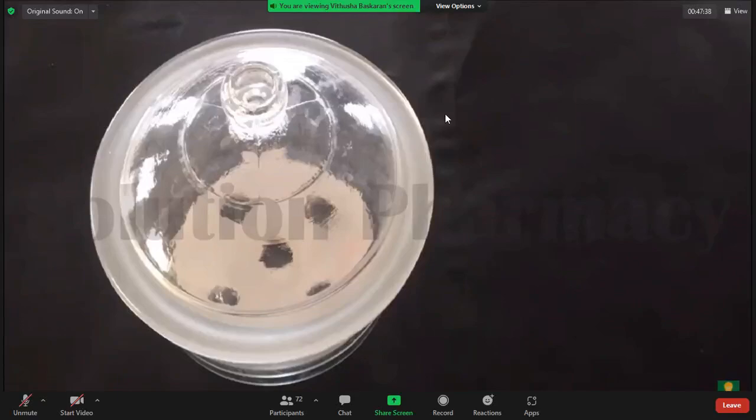It is one of the types of moisture control system in which we keep any sample or material for two purposes: either to dry the sample if any trace amount of moisture is present in it, or, when the sample is once dried, to prevent it from further absorbing moisture, or you can say from reabsorbing moisture from the surrounding atmosphere.